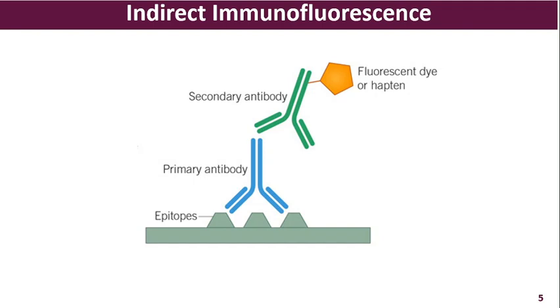give very good fluorescence. The indirect immunofluorescence technique is much superior compared to the direct fluorescence technique, because the primary antibody molecules will bind to several secondary antibody molecules, because of which the fluorescence will be much brighter than that you observe in the direct immunofluorescence.